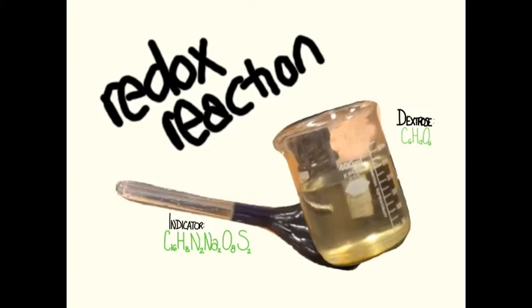In a moment, we'll contribute to the oxidation by shaking the solution. Shaking the solution will add more oxygen, or in other words, further oxidize the solution. This oxidation is why the solution changes colors.